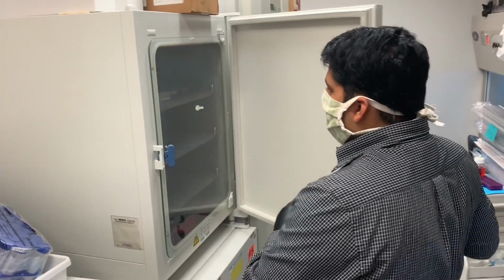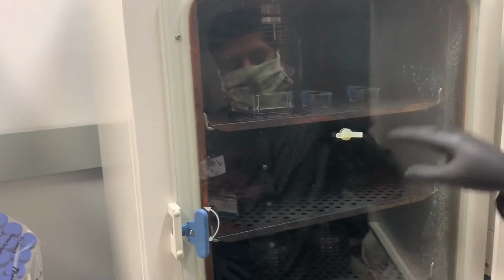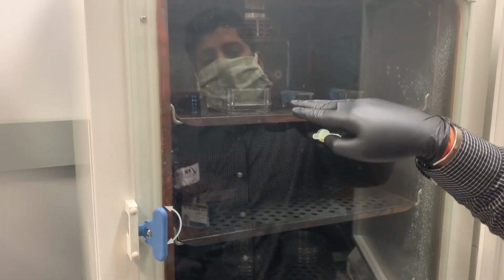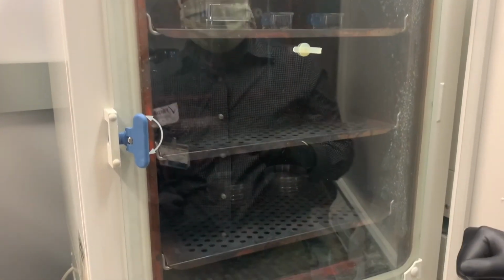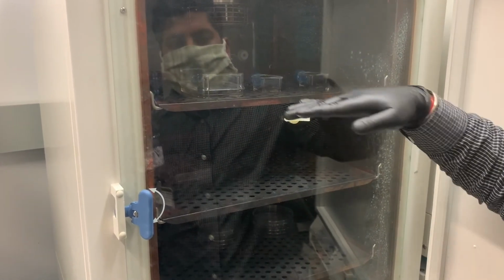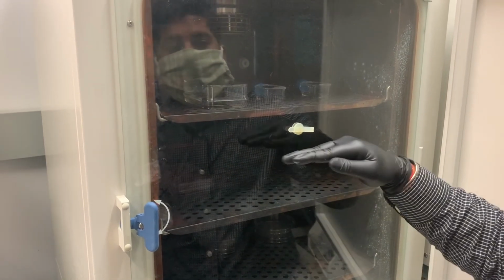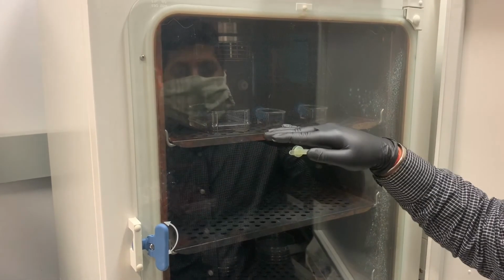So as you can see from the inside of the incubator, there are multiple shelves on which the various cells live. They live within either flasks or plates on each of the shelves, and they live on a monolayer, kind of a single layer at the bottom of the plate or the flask, with media or some sort of liquid to give them nutrients on top of them.